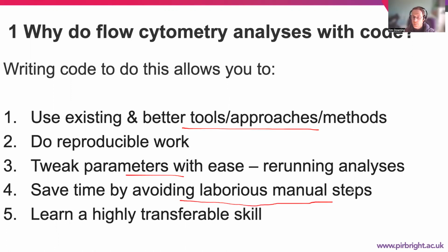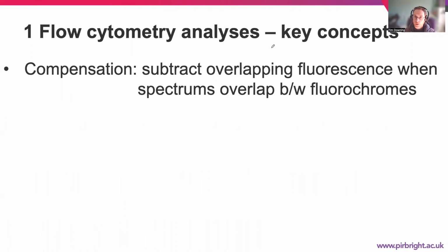Sure, there's a little bit of learning at the start, but you actually become much more efficient and manage your time much, much better. And you also learn a highly transferable skill that's applicable in many diverse locations. So all those are good reasons why you should learn to analyze your data with code. So applying this to flow cytometry, there's certain key concepts that we're going to explore.